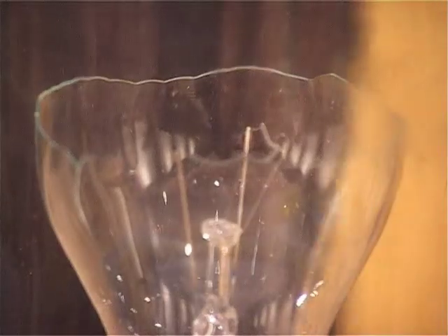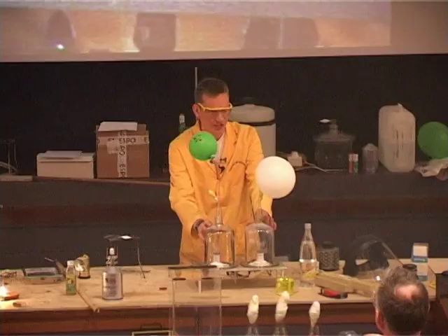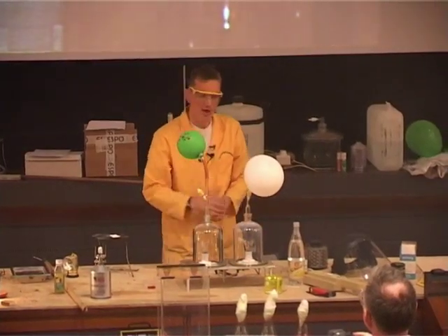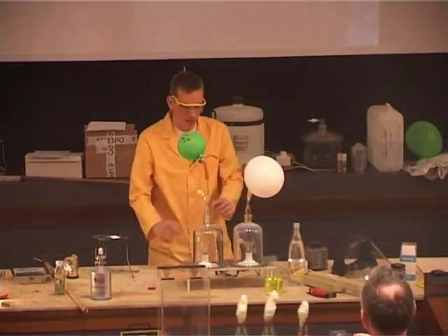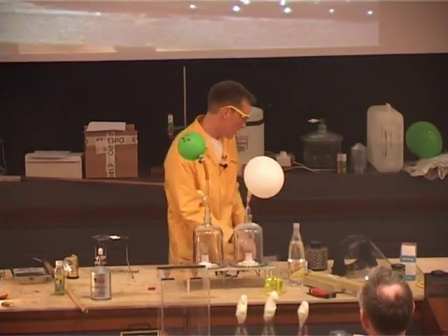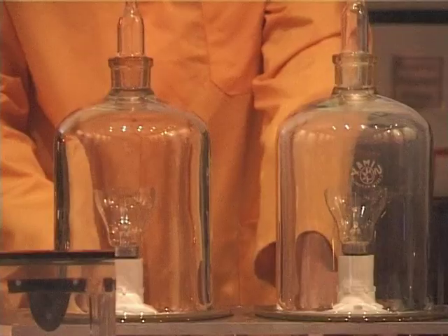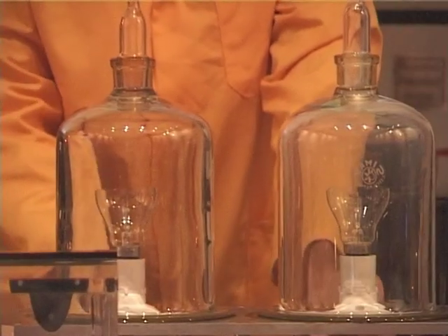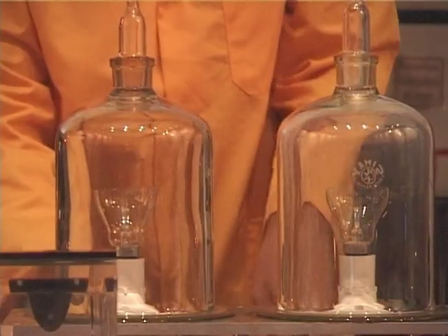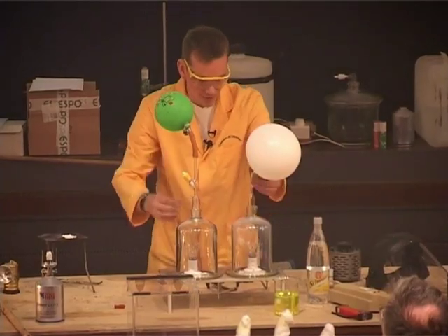I have here two cut-off light bulbs. Maybe if we can zoom in on these. Now, this is a rather tricky demonstration to show here. We've taken the tops off of these light bulbs, and at the moment there's still some gas in here. We're going to remove the gas with the aid of a vacuum pump. So first of all, let's just take the air out of here. Very good.